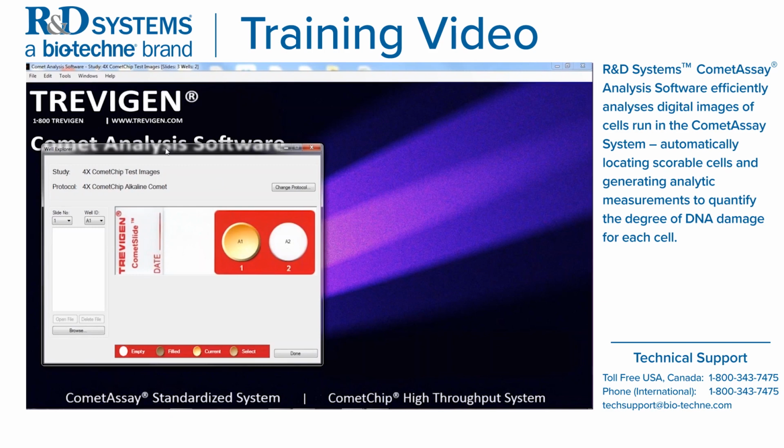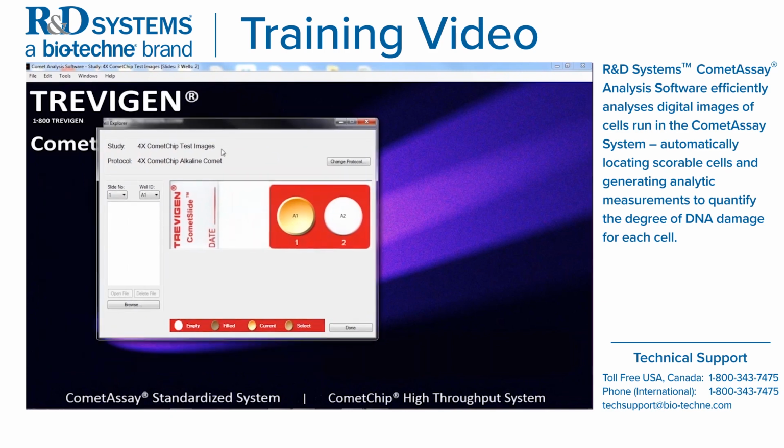So in this step, this is the Well Explorer window. We have our study name, 4X CometChip Test Images. We have a protocol name, which we selected, 4X CometChip alkaline comet. This protocol is what we're going to use to identify the scoreable comets that are within your image. And you always have the ability to change this protocol. So we have a Change Protocol button here.